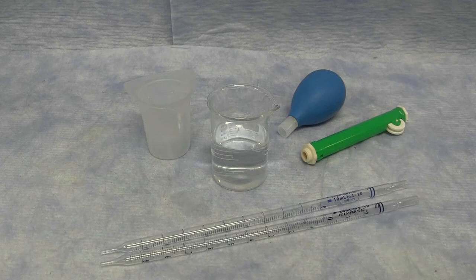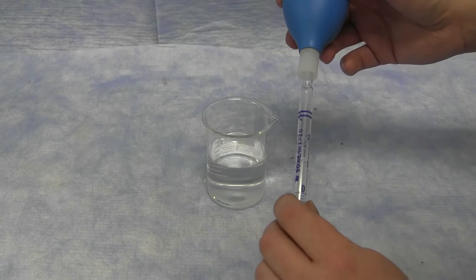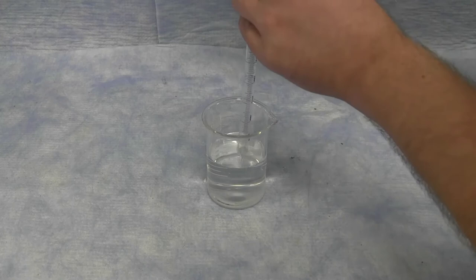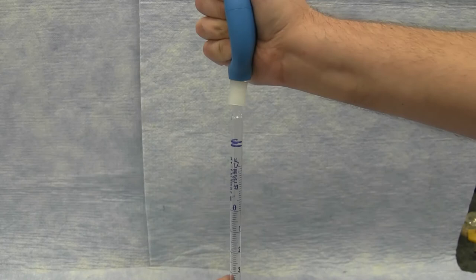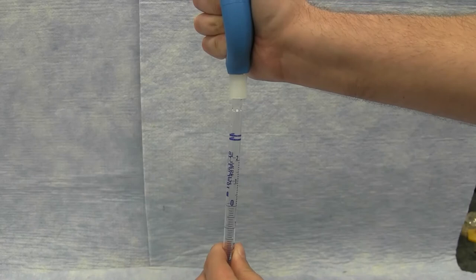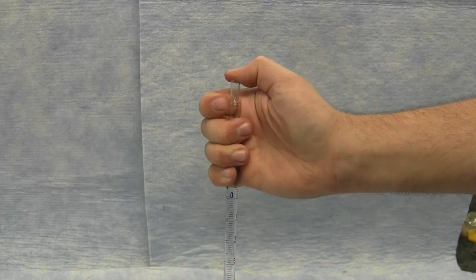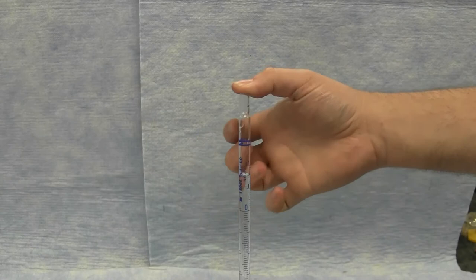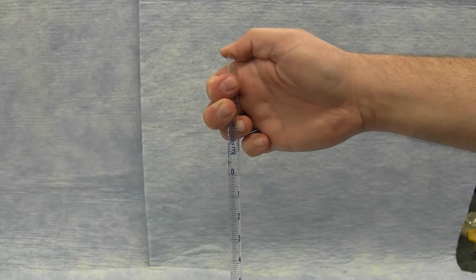To pipette using a pipette bulb, the bulb itself is very loosely placed on the opening of the pipette, squeezed, and then placed inside the solution in order to draw up some liquid. As you release the pressure on the pipette bulb, liquid is drawn up into the pipette. And for quick release, you can drop the pipette bulb and cover the pipette with your thumb. This allows all of the liquid inside the pipette to remain, and you can use the pressure on your thumb to slowly release the liquid in the pipette to the appropriate level.